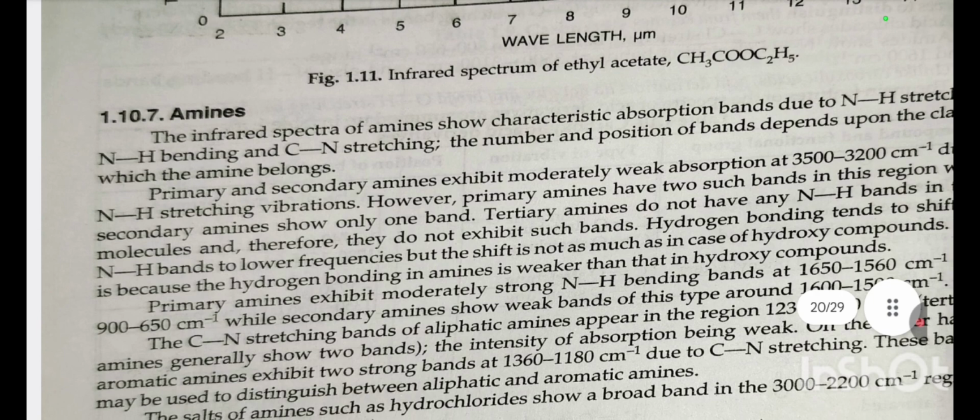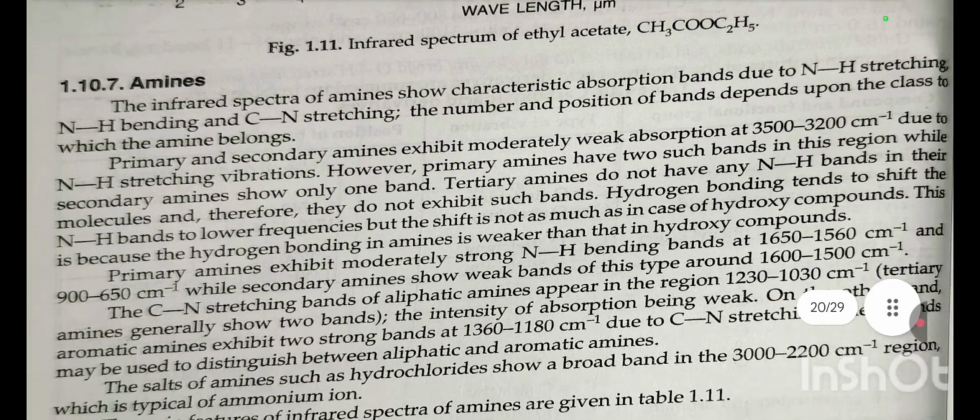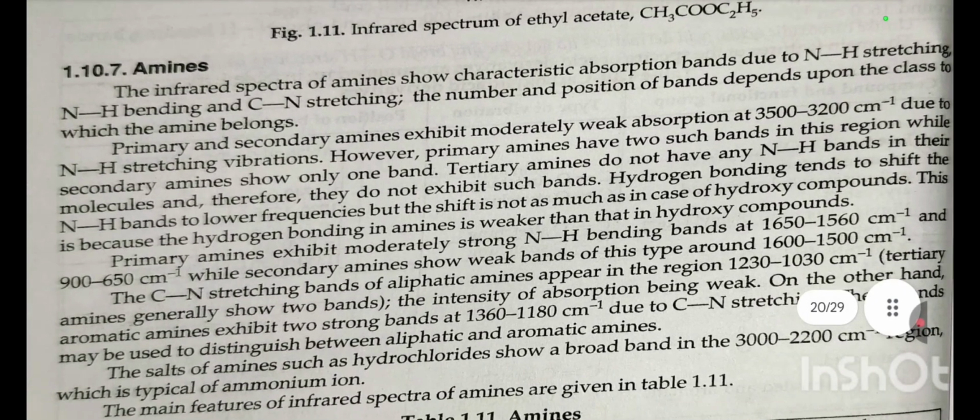Amines. The infrared spectra of amines show characteristic absorption bands due to N-H stretching, N-H bending, and C-N stretching.